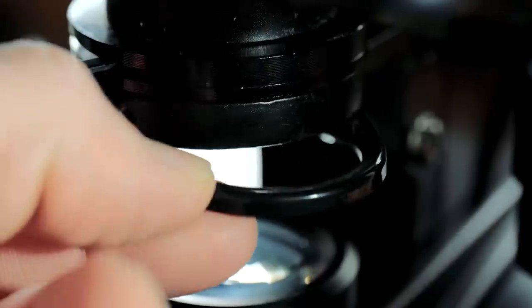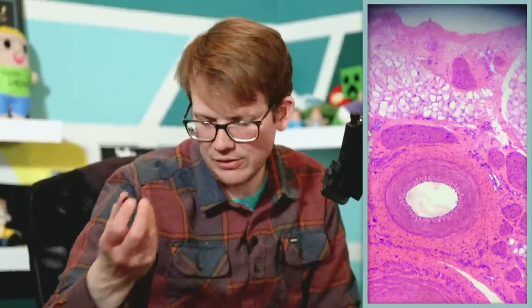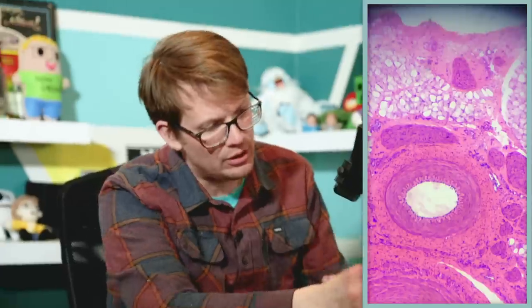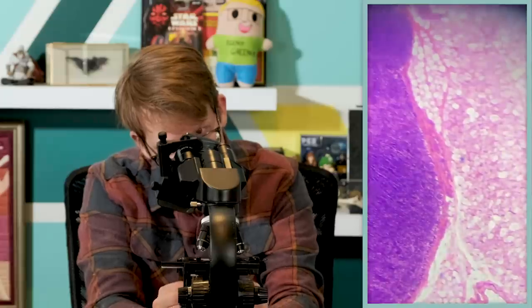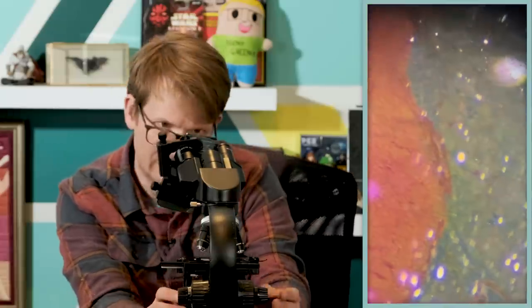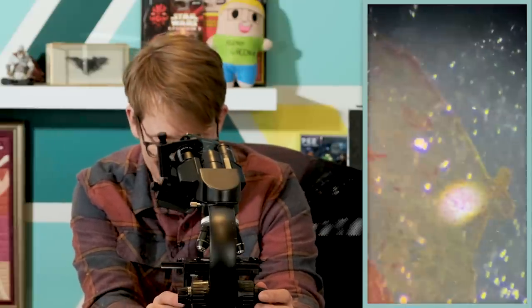On the bottom of our microscope there is a filter tray. You can put in the blue light filter that comes with the microscope, or we have a set of various filters that do various things, and Rheinberg filters that will change the color of an image. So without the filter — and then we're going to slide the filter in place and see what happens. You get like a dark field effect, which on an anatomy slide isn't the greatest thing because it's been dyed for a specific purpose. But with your microbes from your local pond, it looks fantastic.